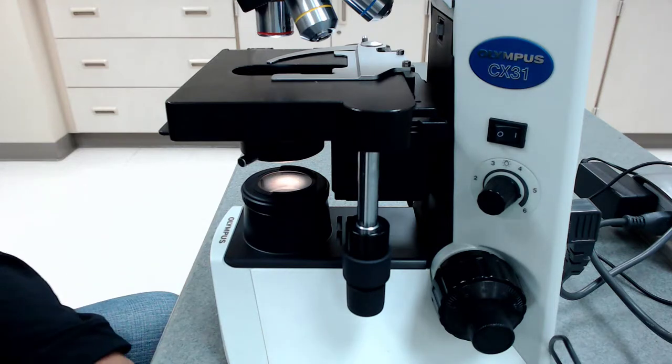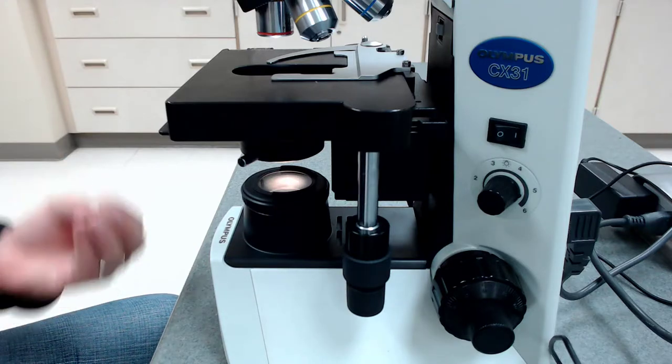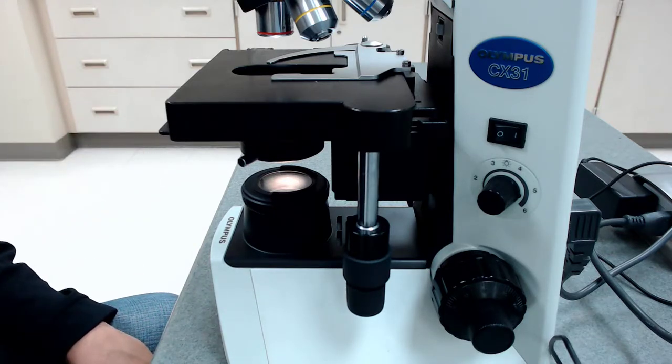All right, other major features of the microscope. So that's how you can control the light that goes through your specimen. How do we control where the specimen goes?